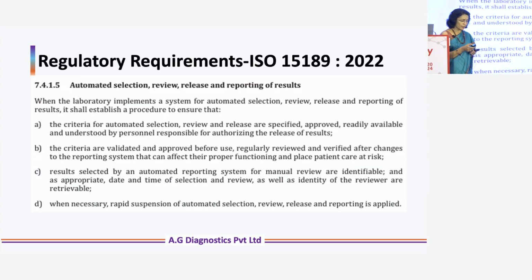So what are the regulatory requirements? The ISO 15189:2022 speaks about automated selection, review, release and reporting of results. So it says that these criteria are specified, approved, readily available and understood by personnel responsible for authorizing the release of results. The criteria are validated and approved before use, regularly reviewed and verified after changes to the reporting system that can affect their proper functioning and place patient care at risk. So you may change the method, you may change the reference interval. So all that has to be immediately incorporated.